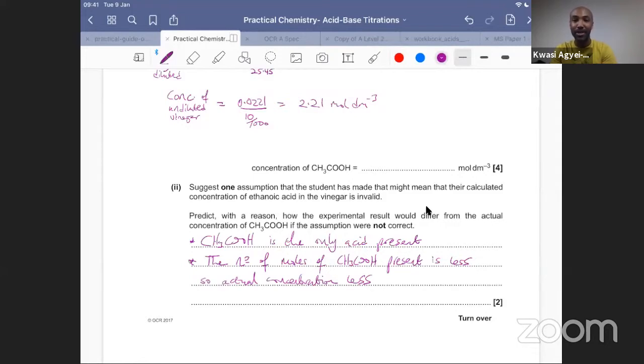Okay, so that has been hopefully a good refresher on acid-base titrations. What I'd urge you to do is go away and review the different aspects of the technique required to obtain accurate titration results, and then go one step further and tackle some actual titration calculations of the sort we've just looked at.